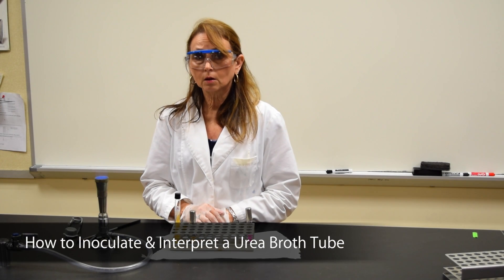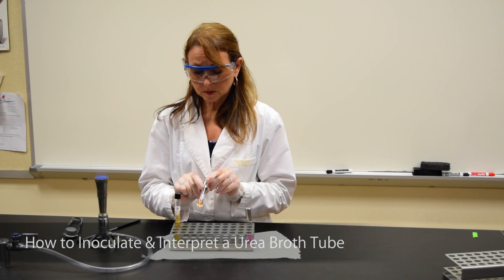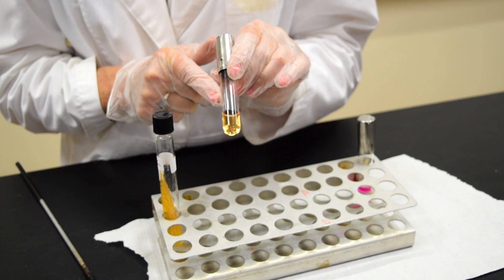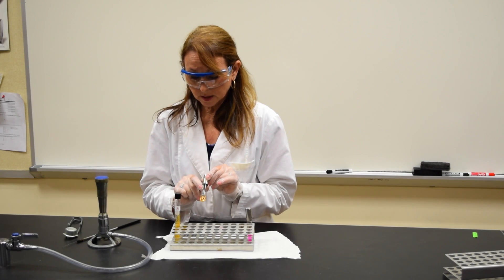This demonstration is to show you how to inoculate and interpret a urea broth test. This is a urea broth tube that contains urea and the pH indicator phenol red. It is a light peach color.